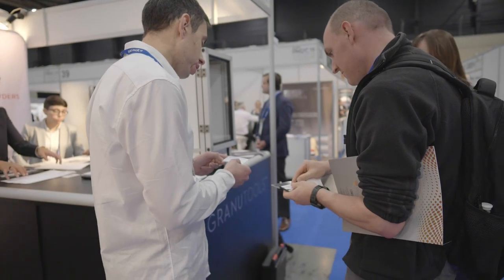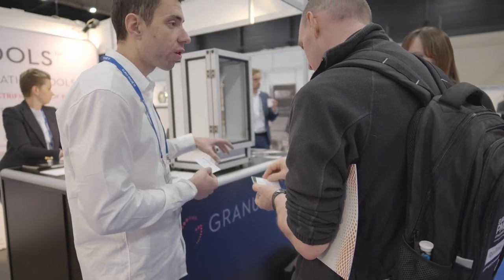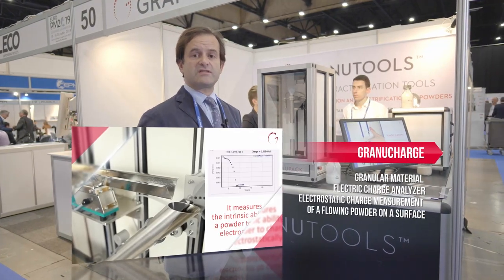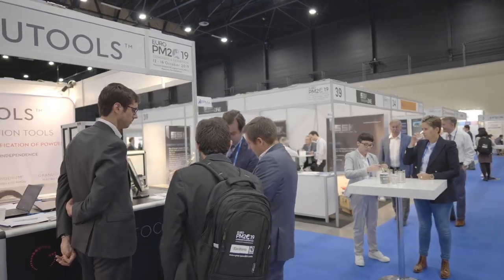These instruments are two building blocks of the Granutools additive manufacturing workflow. On top of that, we also have the Granucharge, which is a tribocharger to assess electrostatic properties of powders, which is becoming increasingly relevant for additive manufacturing.